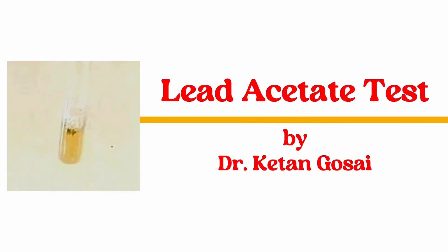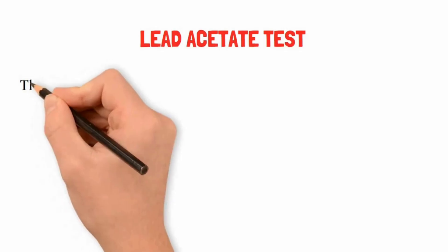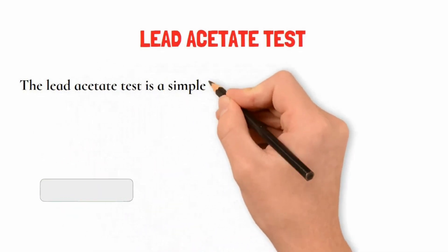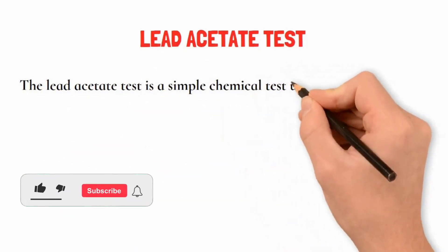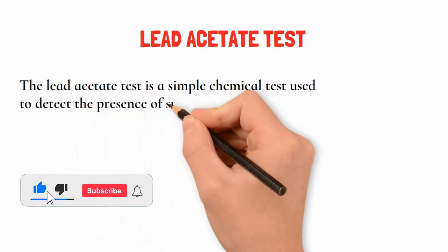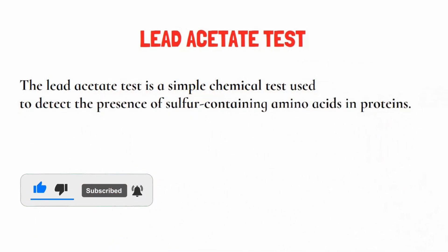Hello friends, in this video we will perform the lead acetate test. Lead acetate test is a simple chemical test used to detect the presence of sulfur-containing amino acids in proteins.